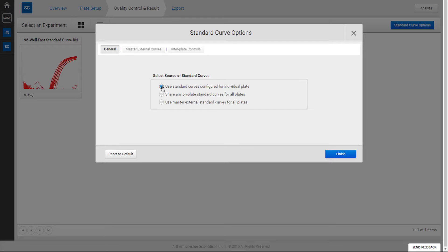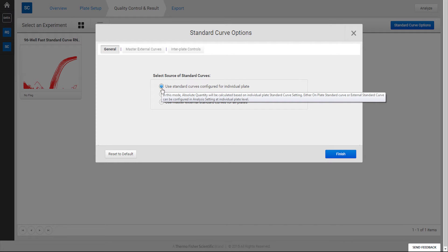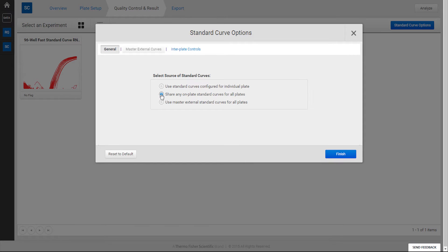The first option is to use individual Standard Curves independently on each plate. The second option is to use the Standard Curve defined on one plate across all plates in the project. The last option is to use an external Standard Curve and apply it to all plates within a project.